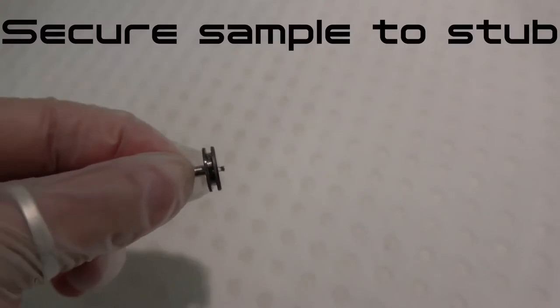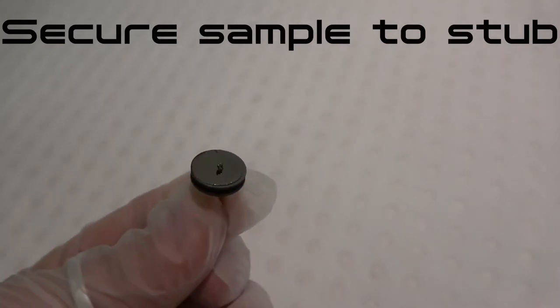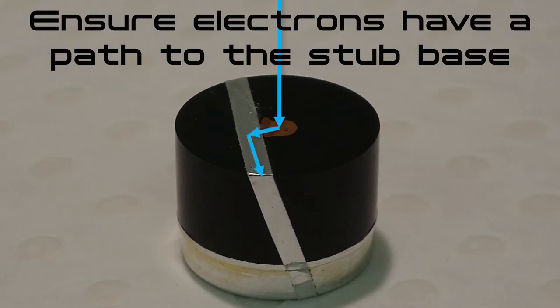When mounting samples for SEM, our main goals are to secure the sample to the SEM stub so that it does not move during examination in the microscope, and to ensure that the negative charge generated by the electron beam has a pathway away from the sample surface to the conductive stub base.